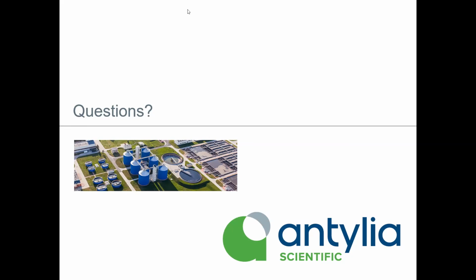But what you'll become familiar with is the time that it takes for the auto buffer recognition to work. So, in a brand new tester, for example, or a pH electrode, you're going to go bink, bink, bink right to the value. Now, if that value is jumping around, and I mean bouncing around, it reads 4, it reads 8, it reads 6, it's all over the place, you've probably got a coated glass bulb or a clogged liquid junction. Every pH sensor has a liquid junction, which allows the electrolyte inside the electrode or tester to come into contact with the water sample. It's a simple salt bridge. If that is broken, you'll see that bouncing effect.